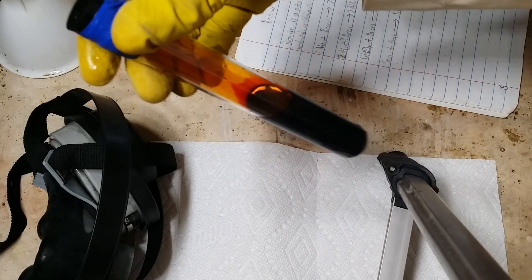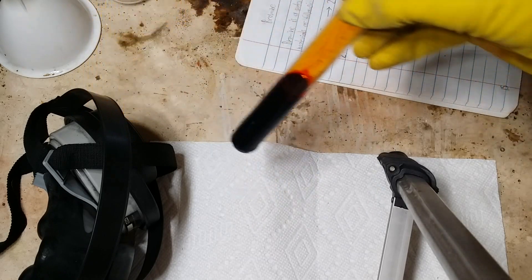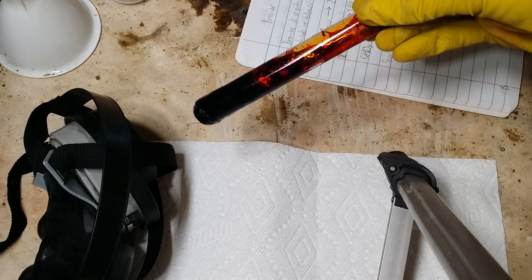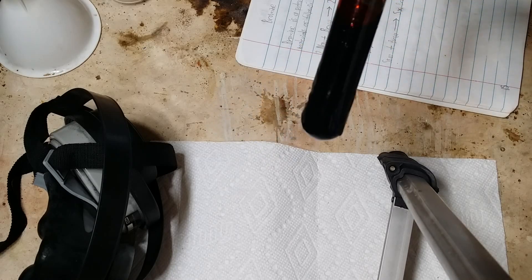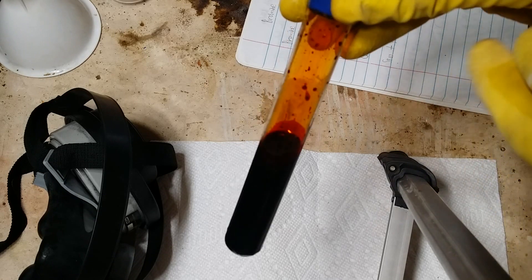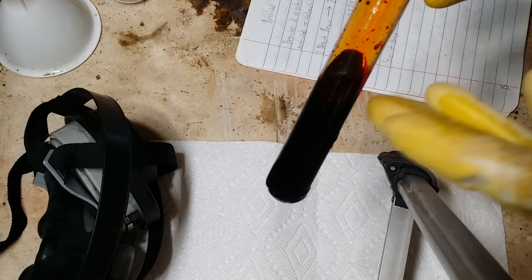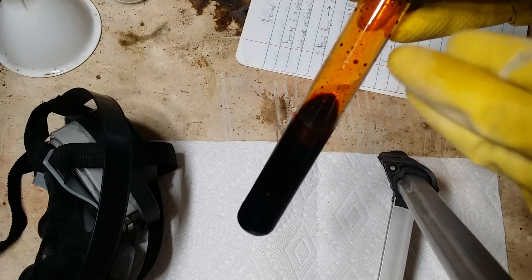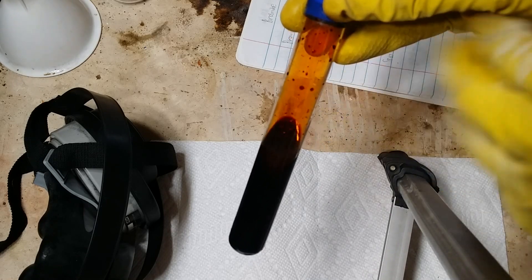So here is elemental bromine — I synthesized this in a previous video. As you can see, bromine is a dark red mobile liquid at room temperature. Though it is very volatile, that means it quickly transitions from liquid to gas phase to produce this orange vapor you see in the test tube.